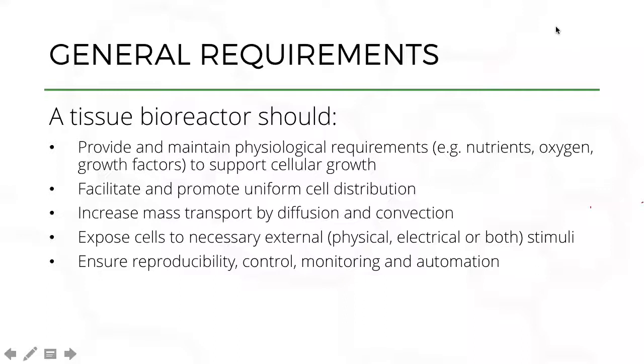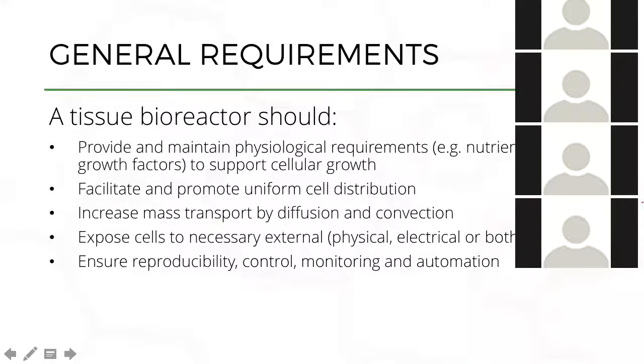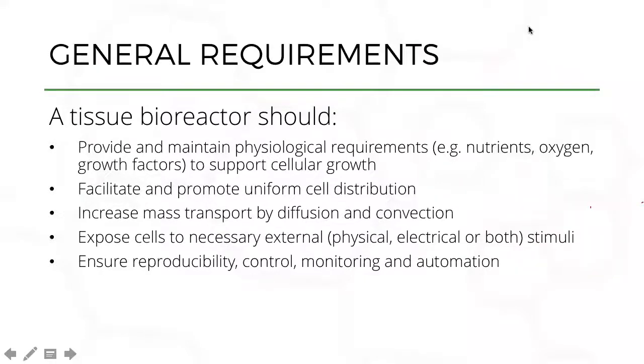The next consideration is how can we expose cells to the necessary external stimuli, right? In this case, it could be electrical stimuli, or mechanical stimuli, or it could be both electrical and mechanical stimuli that you need.